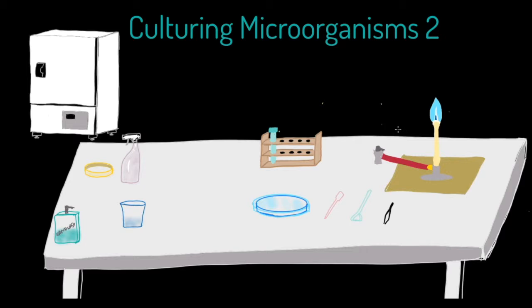So in the second of our tutorials on culturing microorganisms, I want to introduce you to the concept of a bacterial lawn. I'm going to show you how to prepare a bacterial lawn, but in reality, when you do this in your lab, it's quite likely that a technician is going to prepare the lawn for you, and you'll see why in a few moments' time.